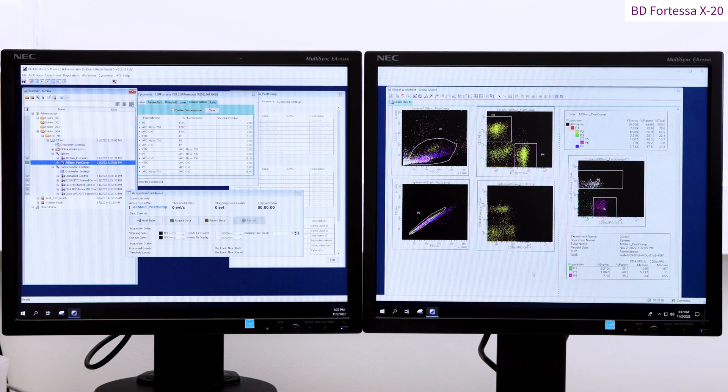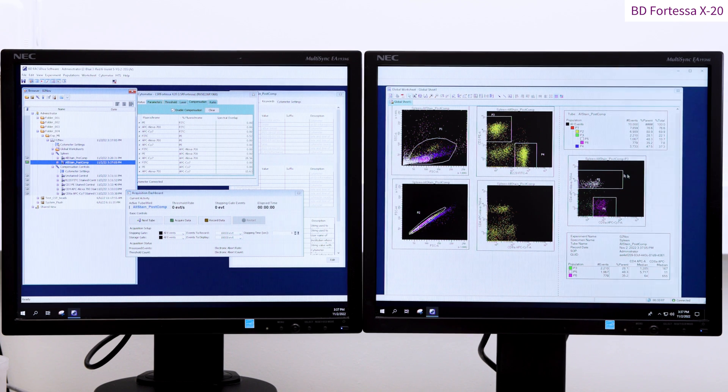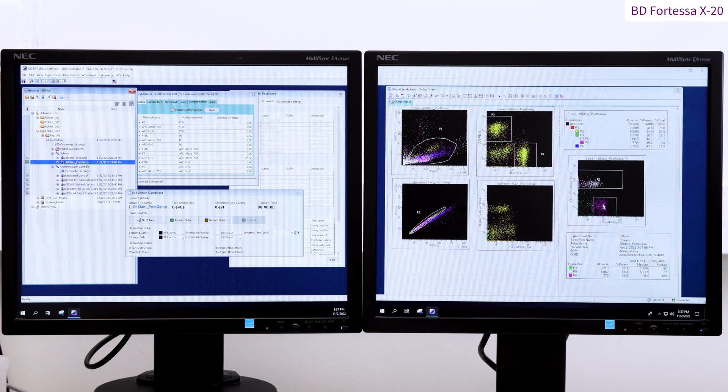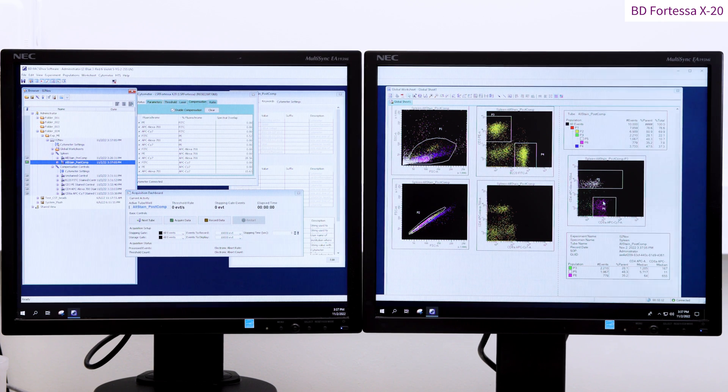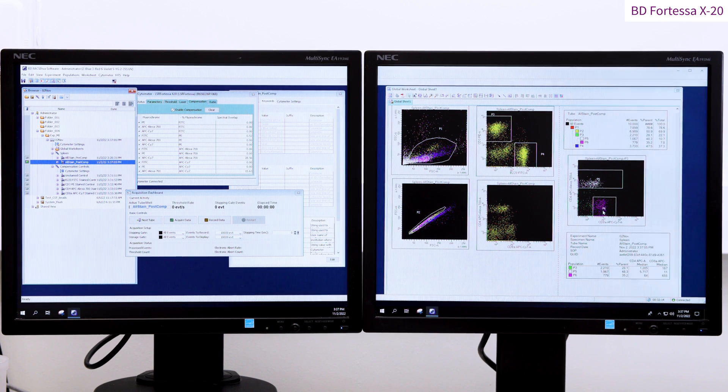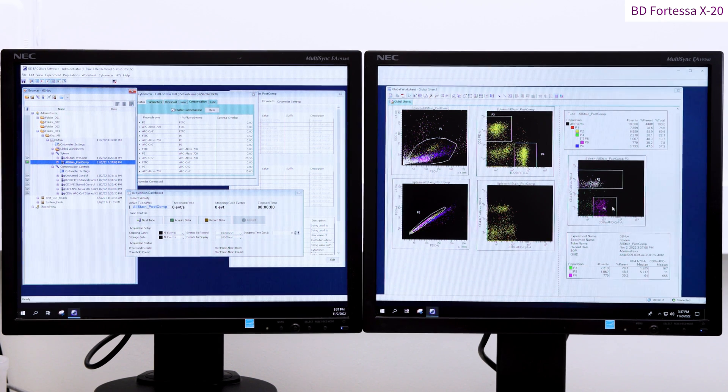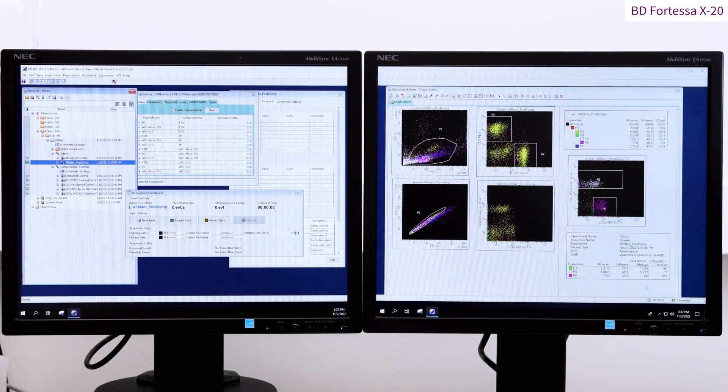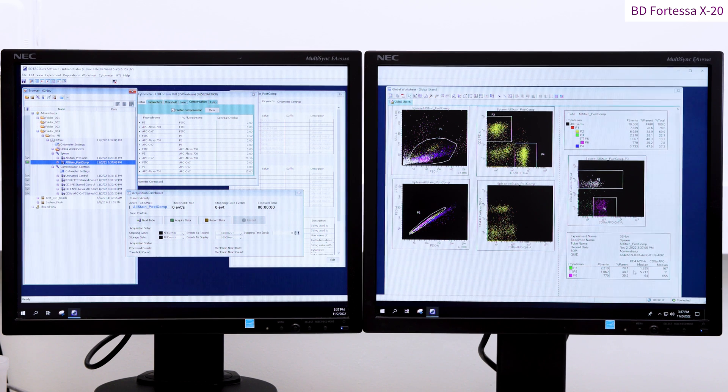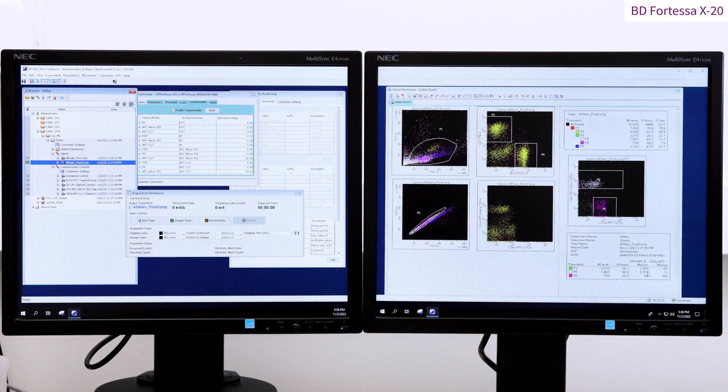The median fluorescent intensity values in the statistics view table can be used to control for the quality of compensation values applied by comparing the double negative events MFI with the single positive events.